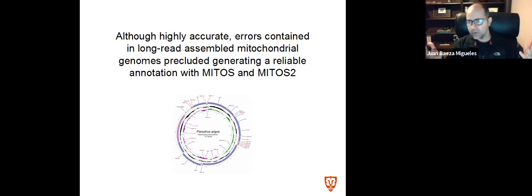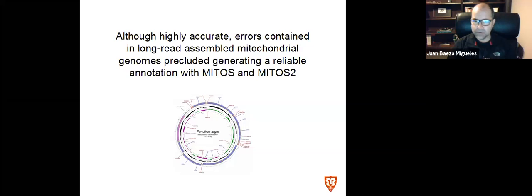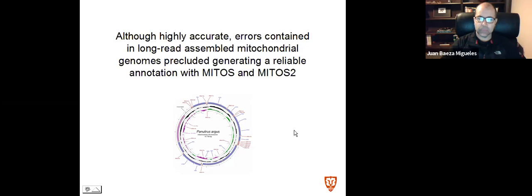I will argue that at this point in time, or let's say during the year 2018, using the bioinformatic tools in this study, the quality of the genomes assembled using long read, though it's very high, is not that accurate, for instance, to proceed to study selective pressures in protein coding genes. Unfortunately, it is not there. I do realize that nanopore sequencing technology's initial sequence error is improving by the month or by the year. So the hope is that maybe in 2 or 5 years, the quality of the mitochondrial genomes that we can retrieve using nanopore long read will be high enough to proceed to do selective pressure analysis with the data sets and with the sequences that we generate using long reads.